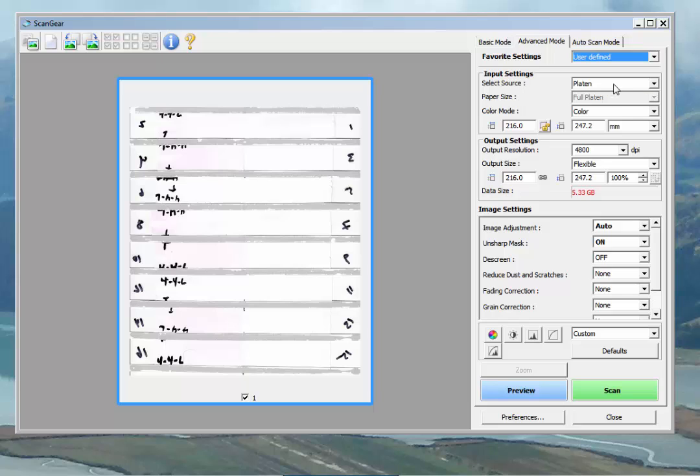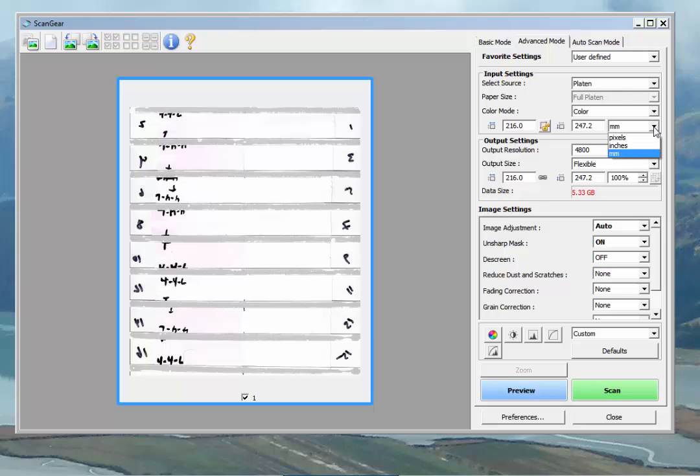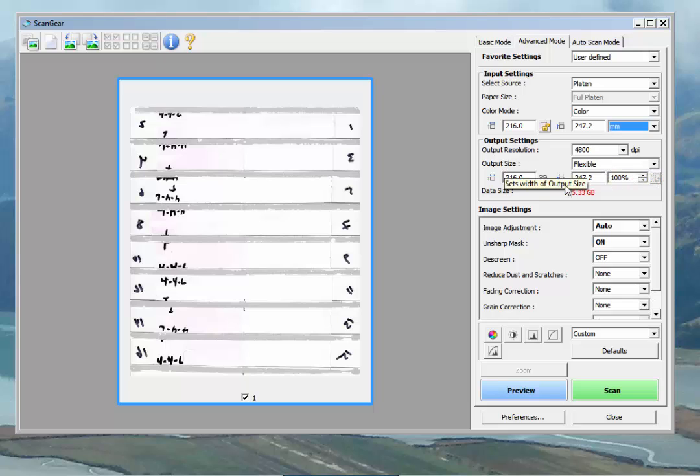Setting sources, platen. Color mode, color. Set your scale to millimeters. You have pixels, inches, or millimeters. Output resolution, 4800 DPI. We don't need to worry about the output size at this point.